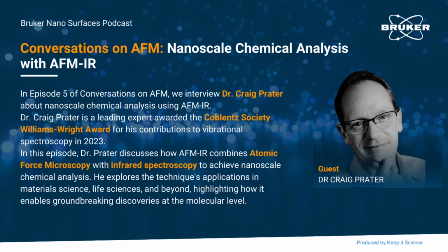And one of the first people who did some work in this area was a researcher at JPL, the Jet Propulsion Laboratory down at Caltech, Dr. Mark Anderson. And he combined a conventional infrared spectrometer, or what's called a Fourier transform infrared spectrometer, with an AFM, and he demonstrated the basic concept of being able to get an infrared spectrum using AFM tip-based detection, and that got us really excited about the potential.